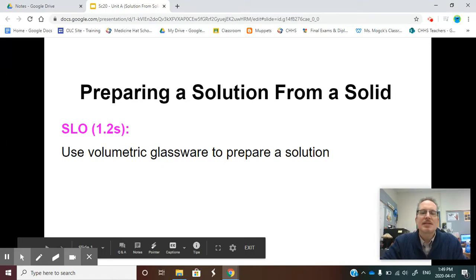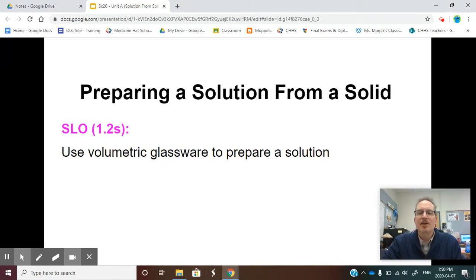Hello, Science 20s. Today is going to be a different lesson. We're going to do one question and then follow it along, and try to figure out a way for me to also show you how to prepare this in the laboratory. So let's get started.